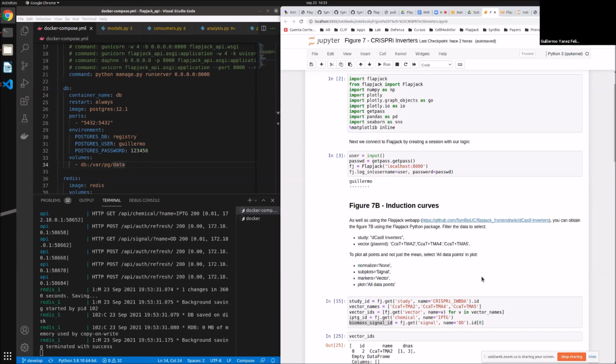now that I have my local installation of Flapjack and I have uploaded data, I now want to explore it, especially if it is from another lab, but Flapjack's data model fits my experimental layout.